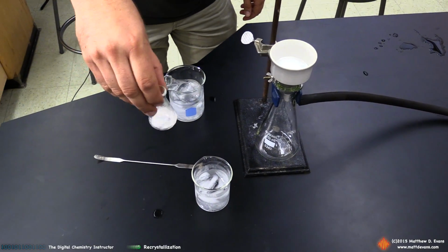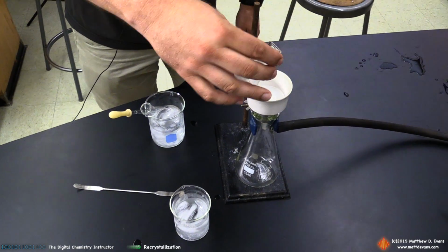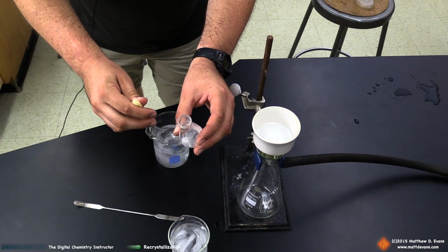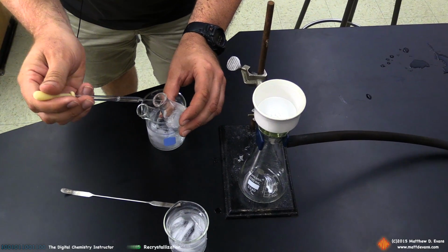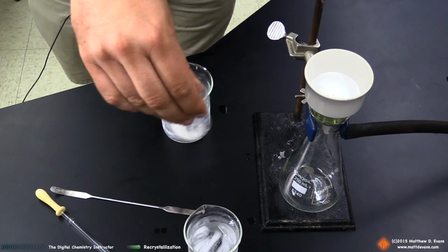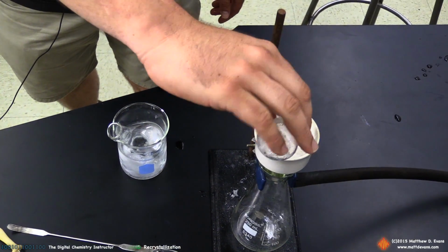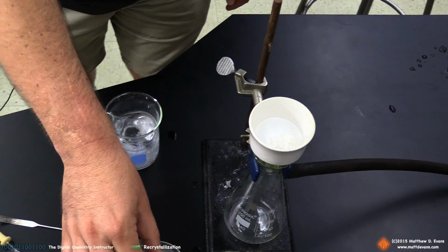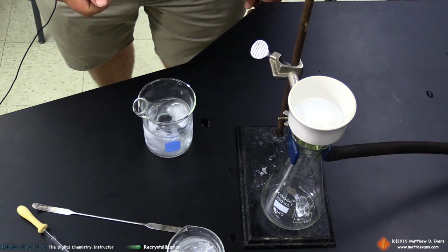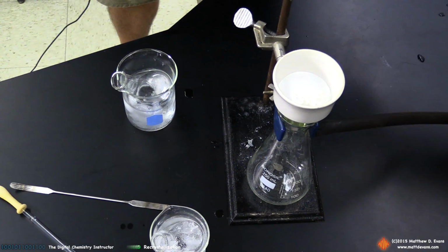The crystals themselves, I'm going to get those going in motion and just do a quick dump with the vacuum on. And I've got about half of them out here, so it might be necessary to add a little more solvent to your crystals. Always add the ice cold. Always add sparingly to your flask. You don't want too many of the crystals to dissolve. And if you saw that, I always get those crystals in motion before I dump. Now they're on top of the filter paper, and they're just sitting there under vacuum. I'm going to turn off the vacuum at this point.